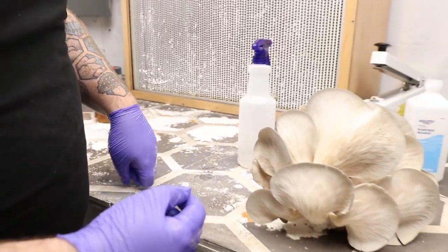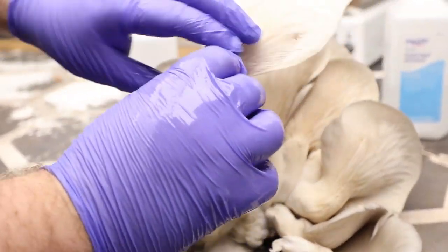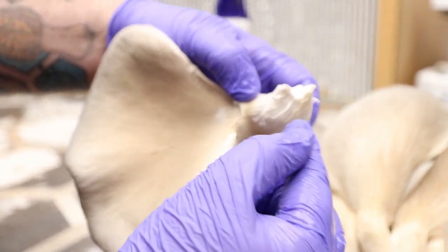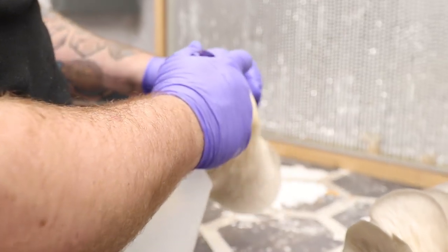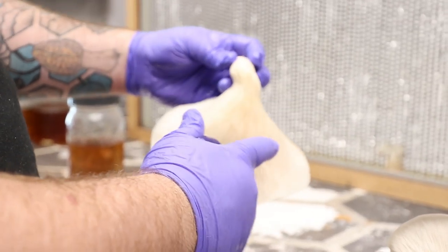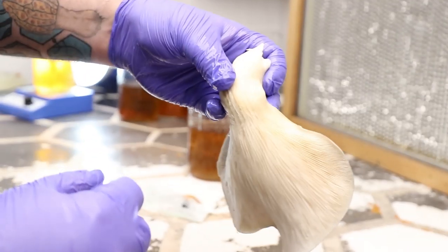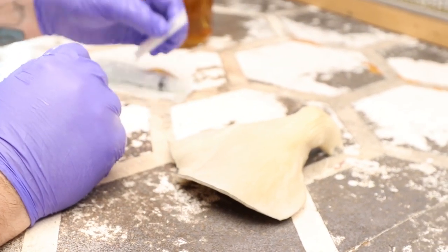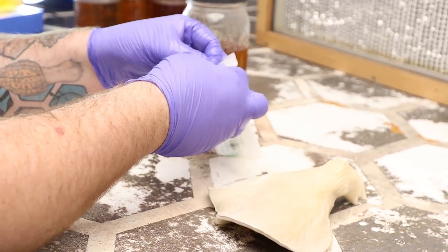Now we're going to select from our mushroom. Like I said before, I always try to pick something that's a little bigger with a stem because that's a firmer flesh, and the mushroom is going to be easier to split open and get to the sterile tissue on the inside. So when I do this, I douse it down with alcohol, then rub my hands down.